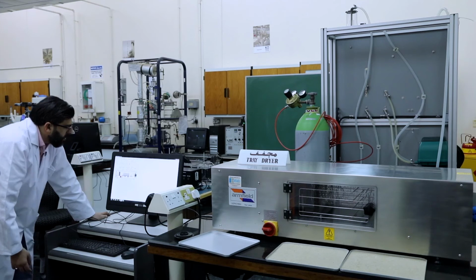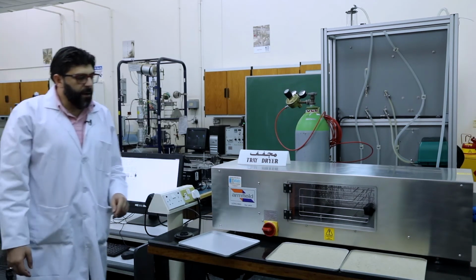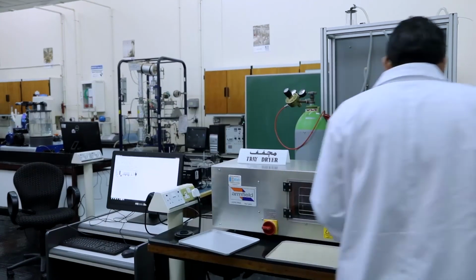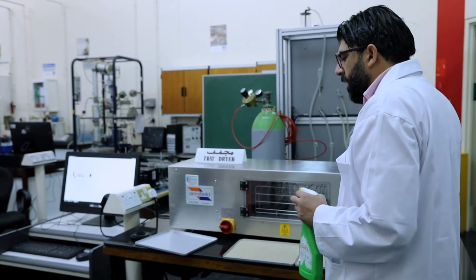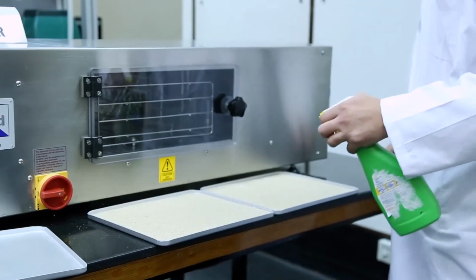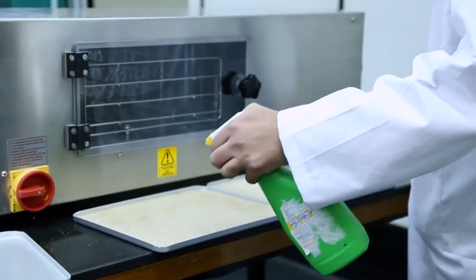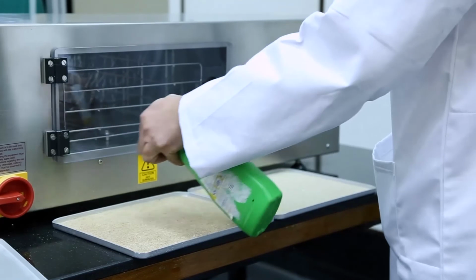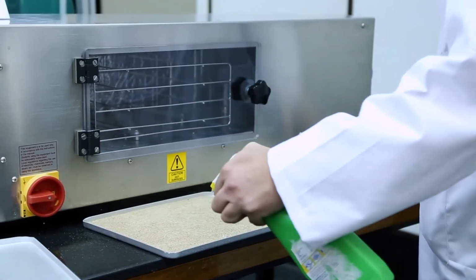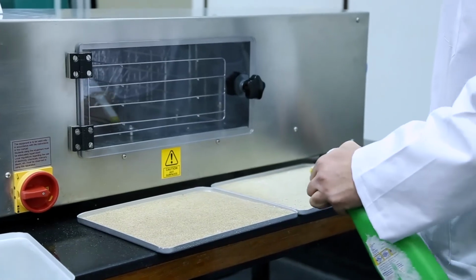So now we'll start our experiment by putting some water on the sand. So we will work only on 2 trays. So during calculation, you have to make sure that the trays area is 2 trays. So cover it with water. You should make sure that the surface is totally covered by water.